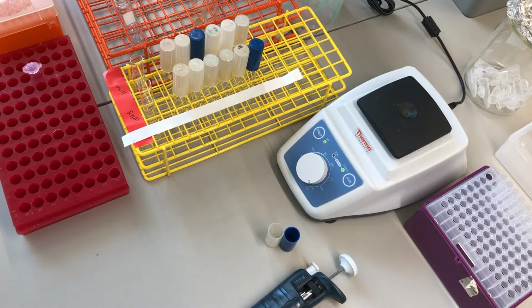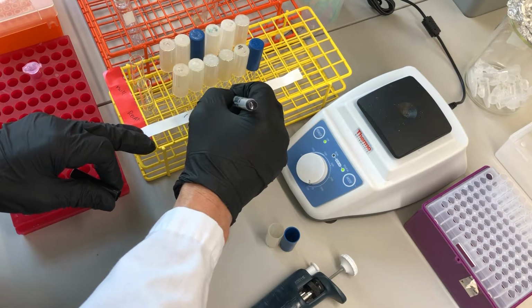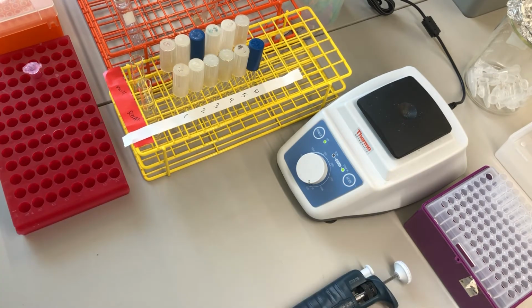Okay, my timer is going, set for 20 minutes. And while that's occurring, I'm going to set up these dilutions. Dilution step 1, 2, 3, 4, 5, and 6. And I can also use these 20 minutes to label my plates.